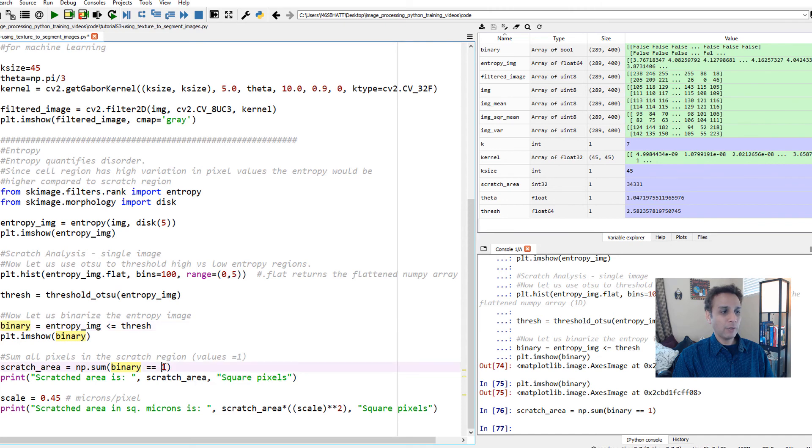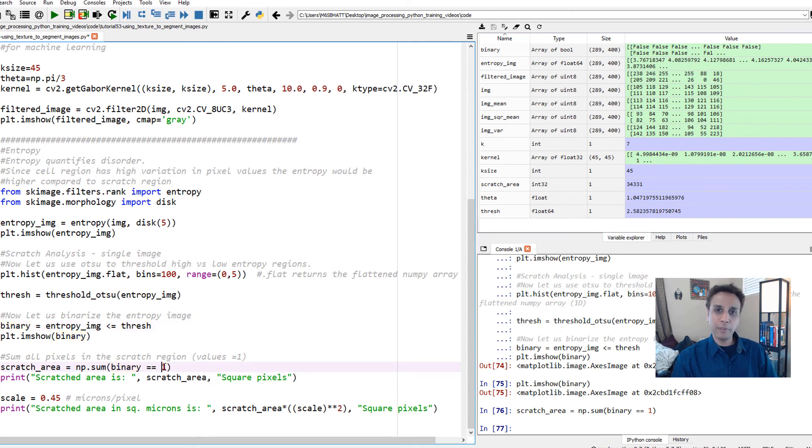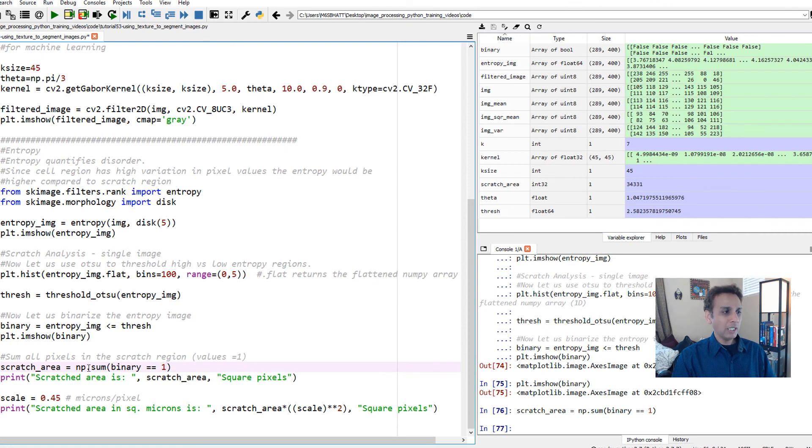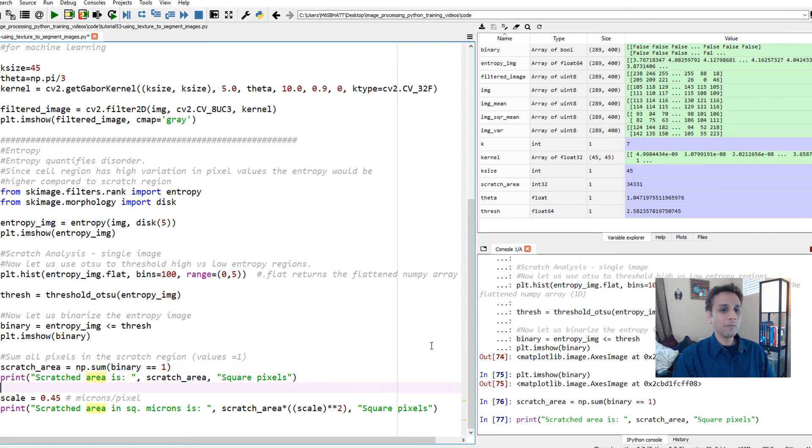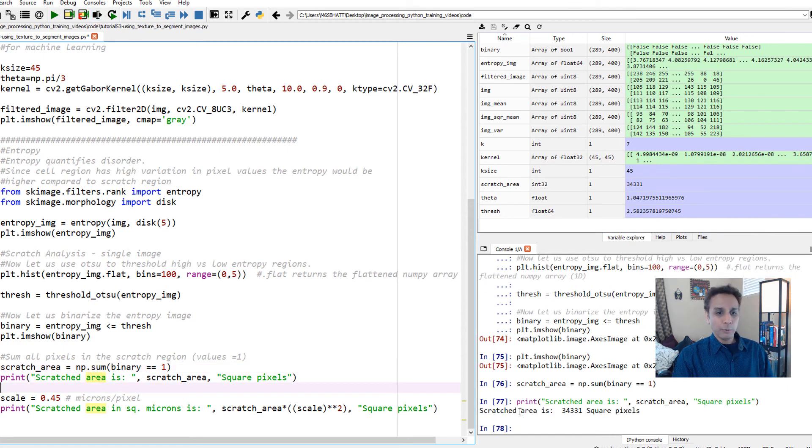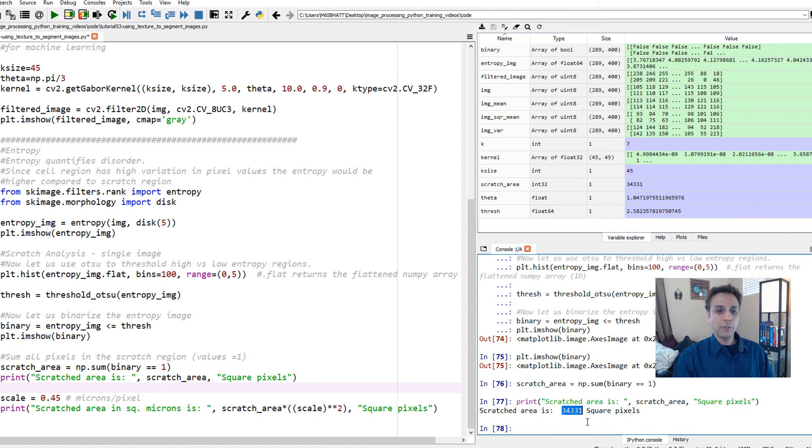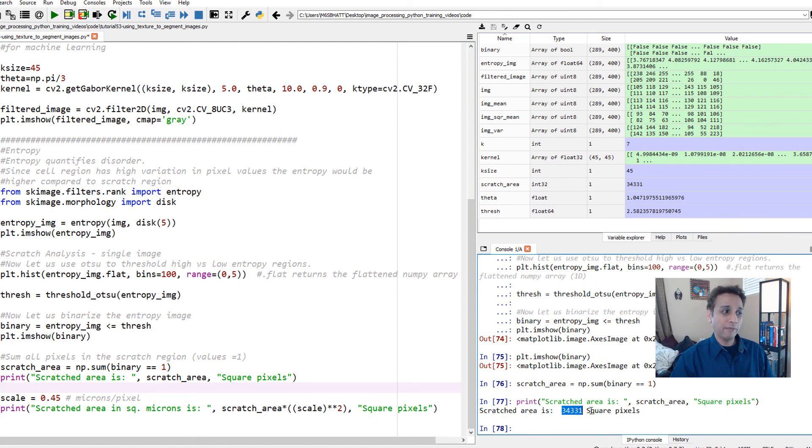When I do np.sum binary equals 1, it's summing up all the pixels where my values are true right here. This line is nothing but: look at my binary image, wherever the value equals to 1 or true - this is boolean, it can be 1 or true - wherever it equals 1, add that and tell me how many pixels. Let's print it. The scratched area is 34,331 square pixels.